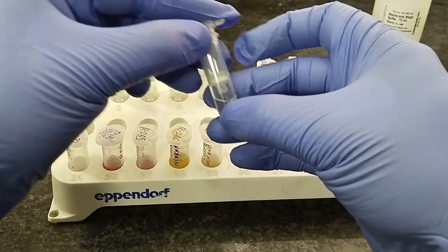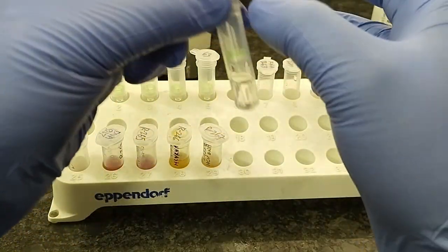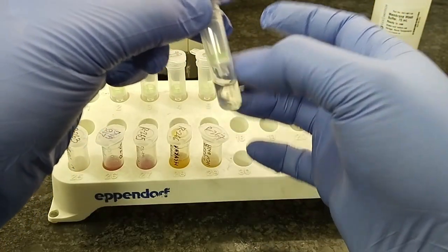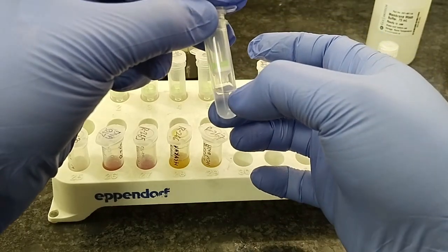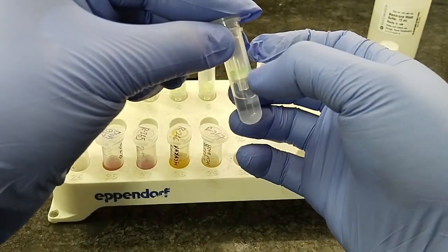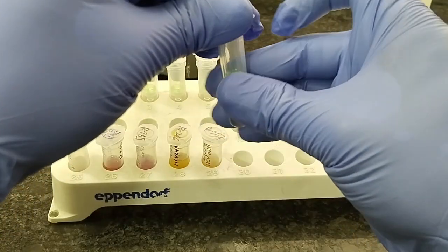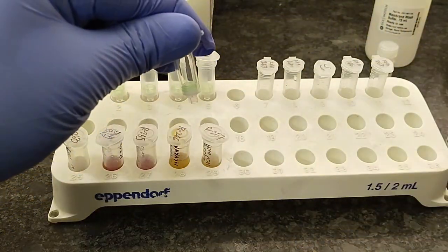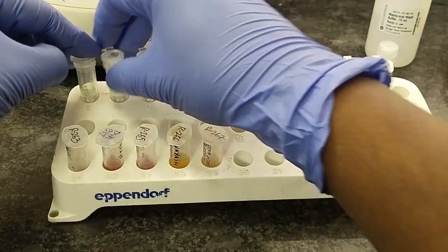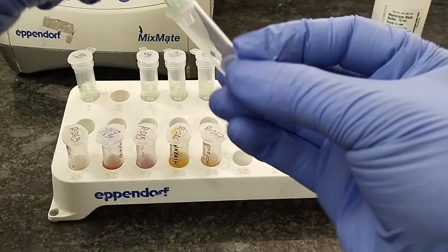So now we have to discard the flow through and put the tube back.